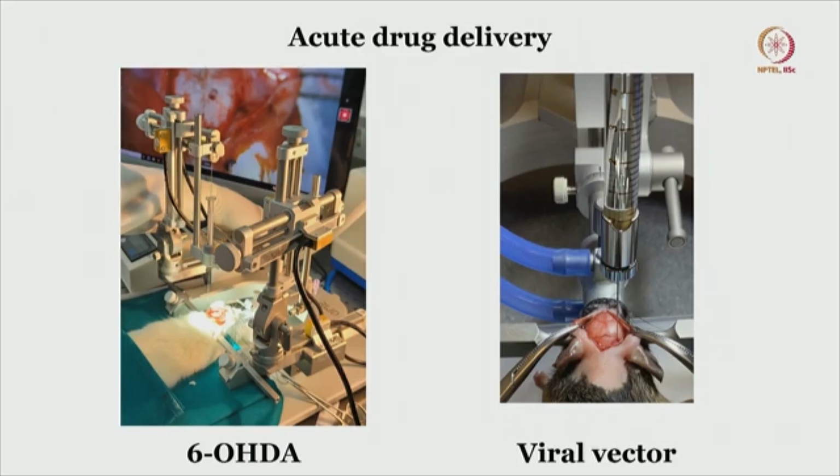So, which we will be discussing in a little more detail in the next few slides. What I am trying to emphasize is that this is a very important methodology with a similar technique, but with different coordinates, different drugs, different agents, and different apparatus that you are going to use. You need to appreciate the changes that you are going to see in each slide with the adapter and the apparatus and the tool that you are going to use to deliver a particular agent or to implant a particular needle or cannula or your microelectrode.